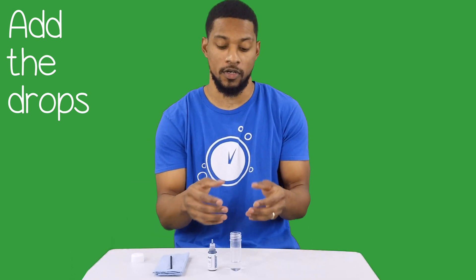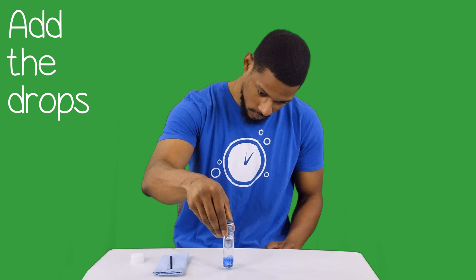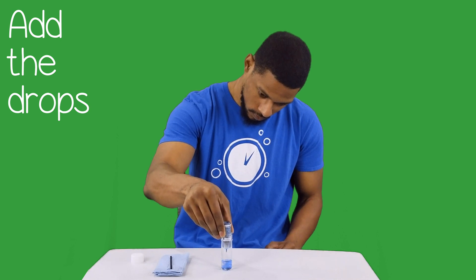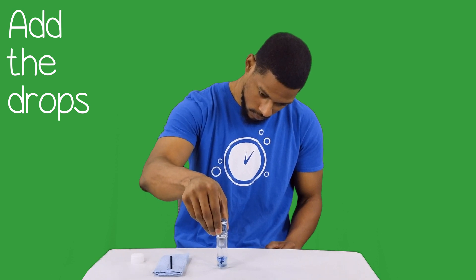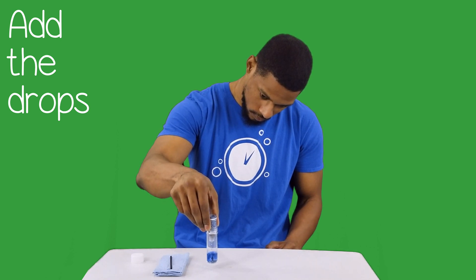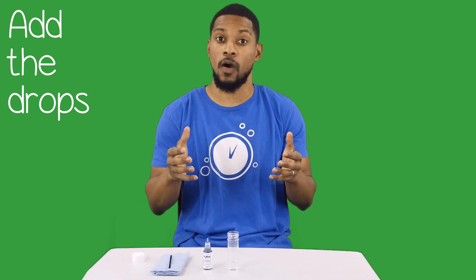Let me demonstrate. This is from a lower concentration of H2 water — result: 0.8 ppm. And this water is of a higher concentration.